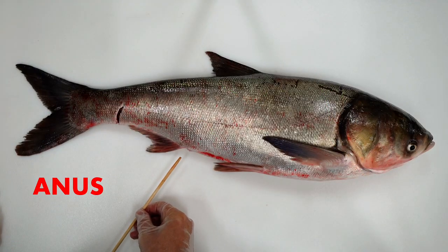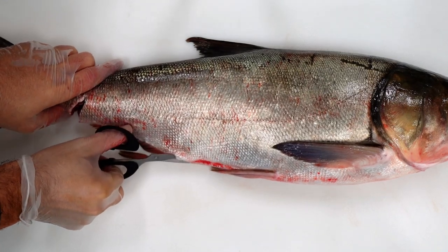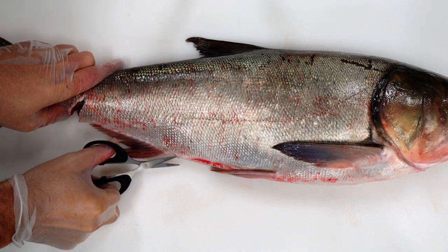Before we explore the internal fish anatomy, let's find the anus. Be sure to insert the rounded part of the scissors and try to cut shallow so as not to damage the internal fish anatomy.